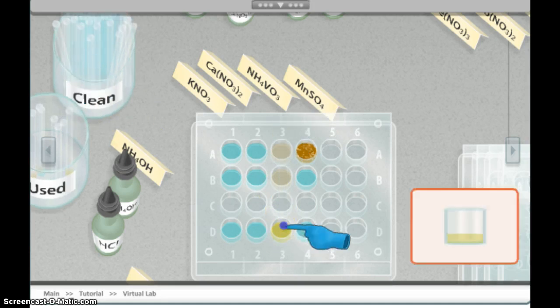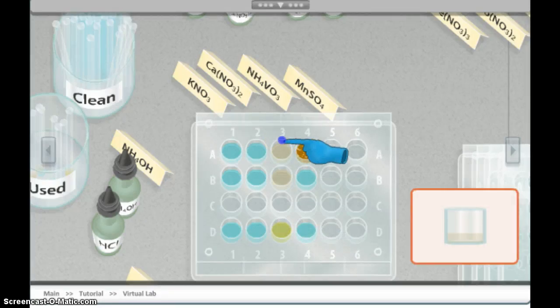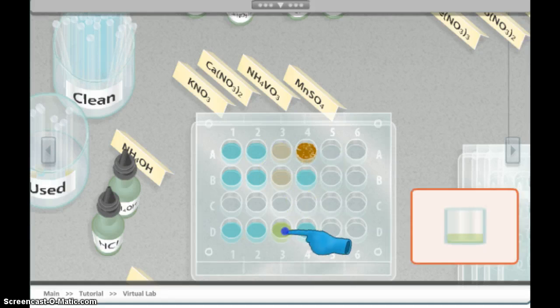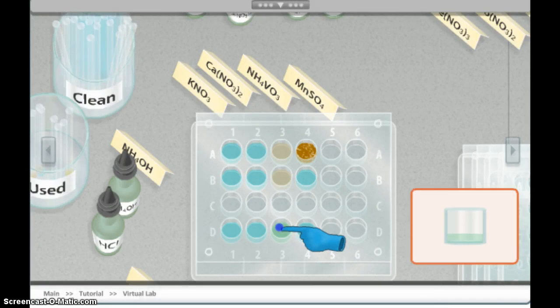All right, so what would you put for these observations? Remember, this is what it looked like if nothing happens. Okay, that's the same as the control. So that's what it started as. And, ooh, something else is happening. Did you notice that? Yeah, it started out as yellow, and now, what would you write down? Hopefully you can see that it's definitely greenish, and now it almost looks blue, doesn't it? Here's a blue one.